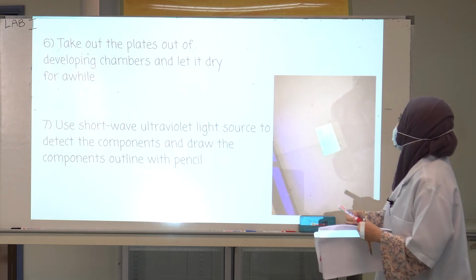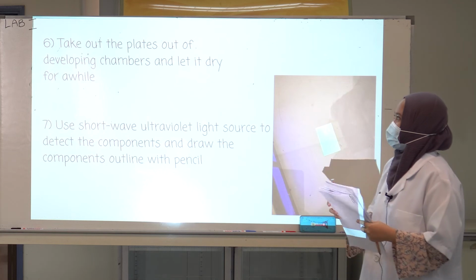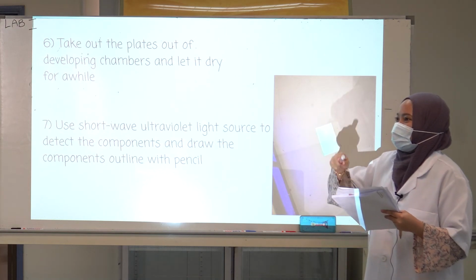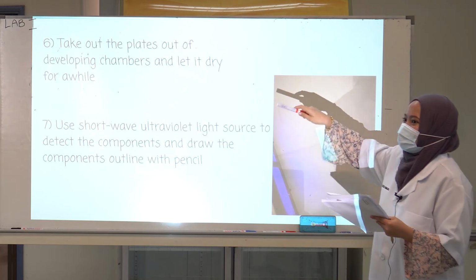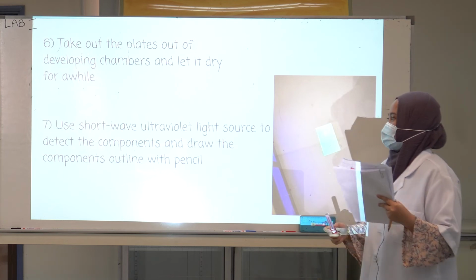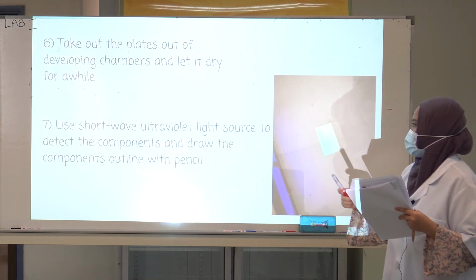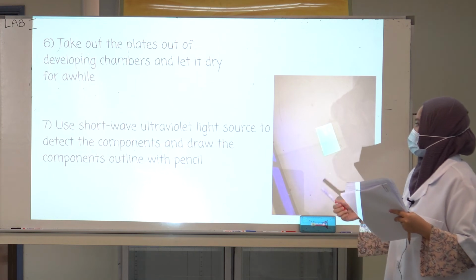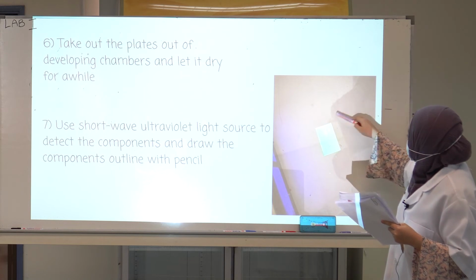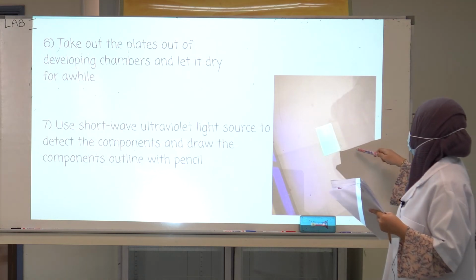It should not exceed the level that we had marked earlier on. And then after that, we use a shortwave ultraviolet light source to detect the components, and it looks like this, and then draw the components' outline with a pencil.